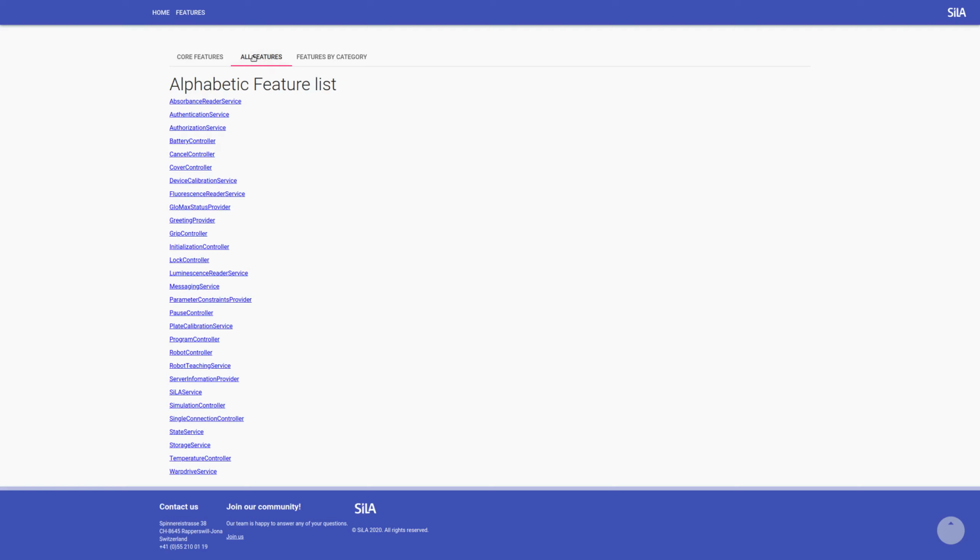And much more features can be seen here with all features. If some feature you need is amongst them, just please feel free to use it. If not, you need to start the development of your own feature.